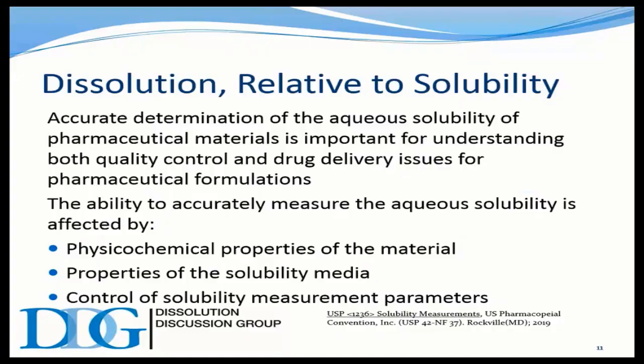As far as dissolution, we are trying to get a very accurate determination in the presence of excipients and so forth, and the manufacturing techniques that go into controlling the delivery of drug as it dissolves. There are a number of factors. It's not just what's in the media that's dissolving it, but there's quite a few properties of the dosage form itself and the API that will control or inhibit or enhance the solubility of this drug in a certain media.